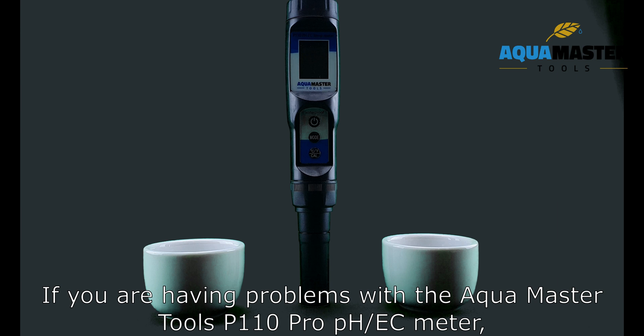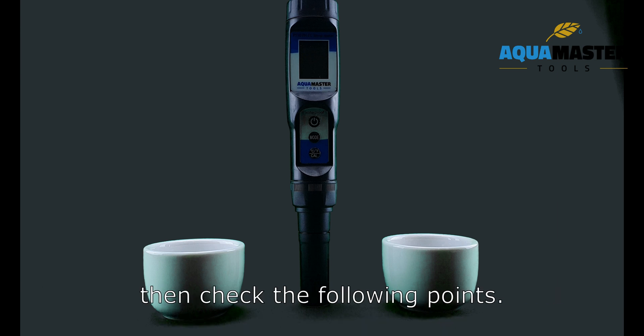If you are having problems with the AquaMaster Tools P110 Pro pH/EC meter, then check the following points.